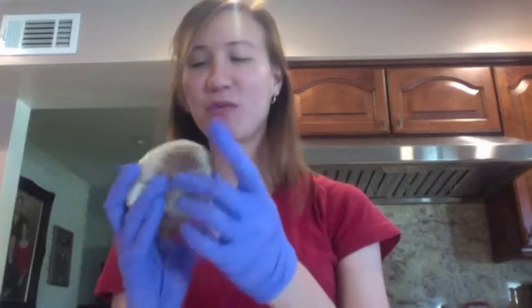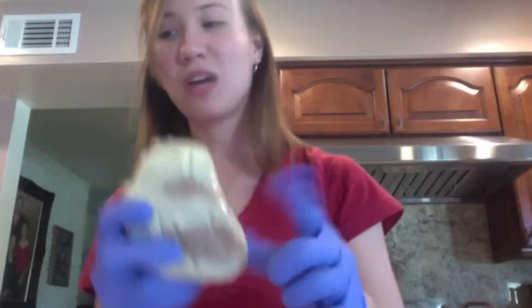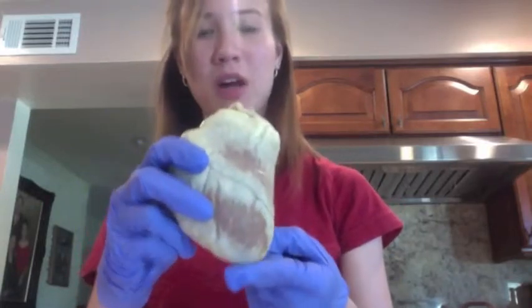So we're going to start off with the visceral pericardium, which is also known as the epicardium. It's usually located on the outside. It is the outermost layer of the heart muscle. Then we have the apex here on the bottom. We have the base of the heart up here.